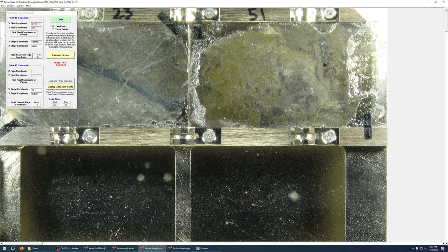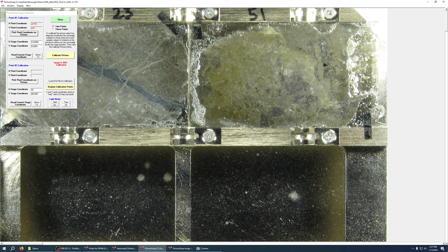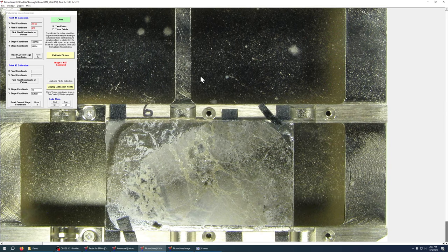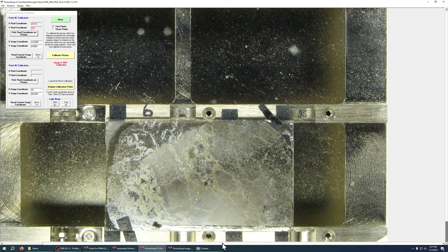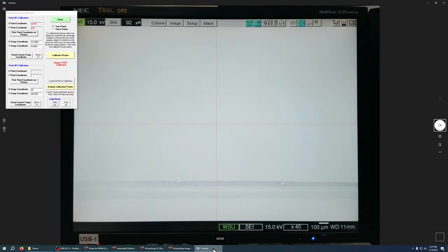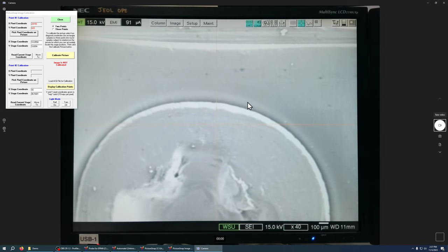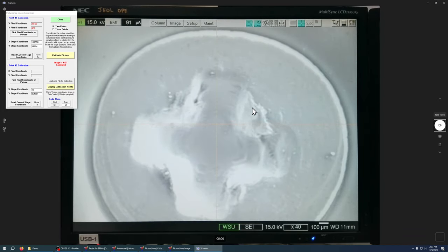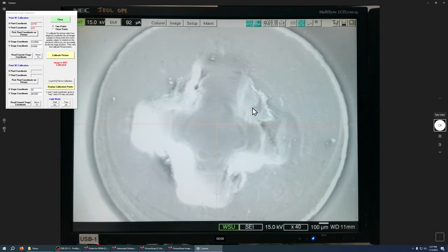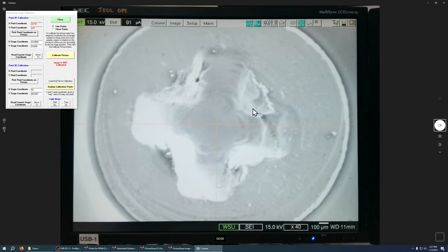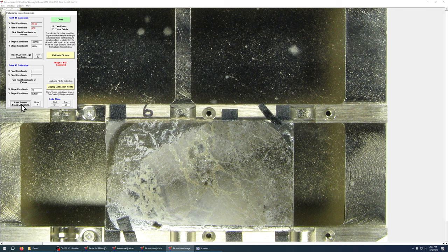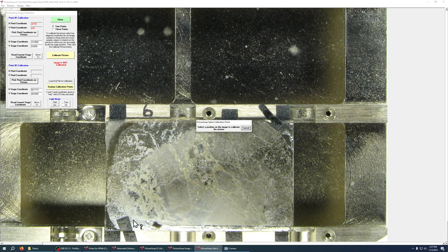Now I need to do that for another point so I'm going to go to the screw down here in the bottom of the image and we will line that up, get it in there pretty good, that looks pretty good and now same thing, read stage coordinate and pick pixel coordinate so that's going to be this guy down here.